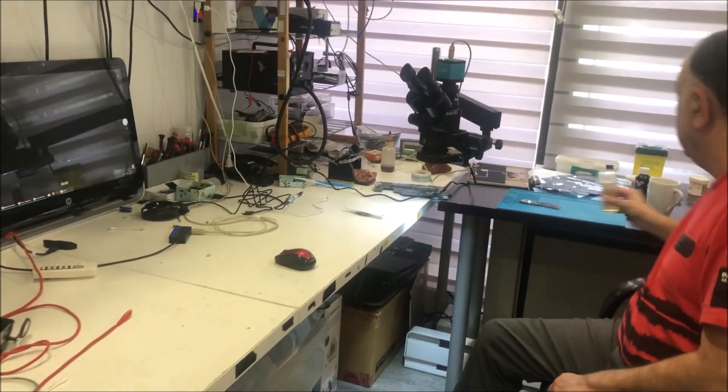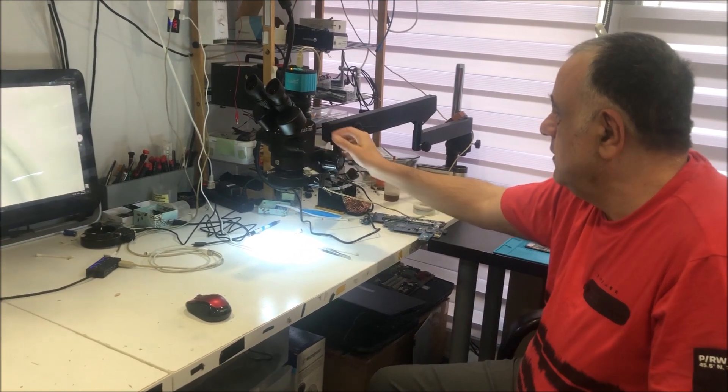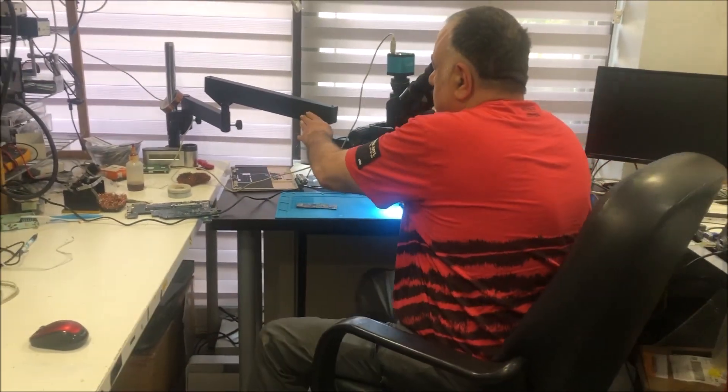Today we're doing a review on the Chinese microscope, the Eakins. The microscope is solid and the articulated arm is great — you can move it up, down, any way you want. If you're limited with space and need to move the microscope around, when you don't use it you just set it aside. It can move to any side, it's fairly good.